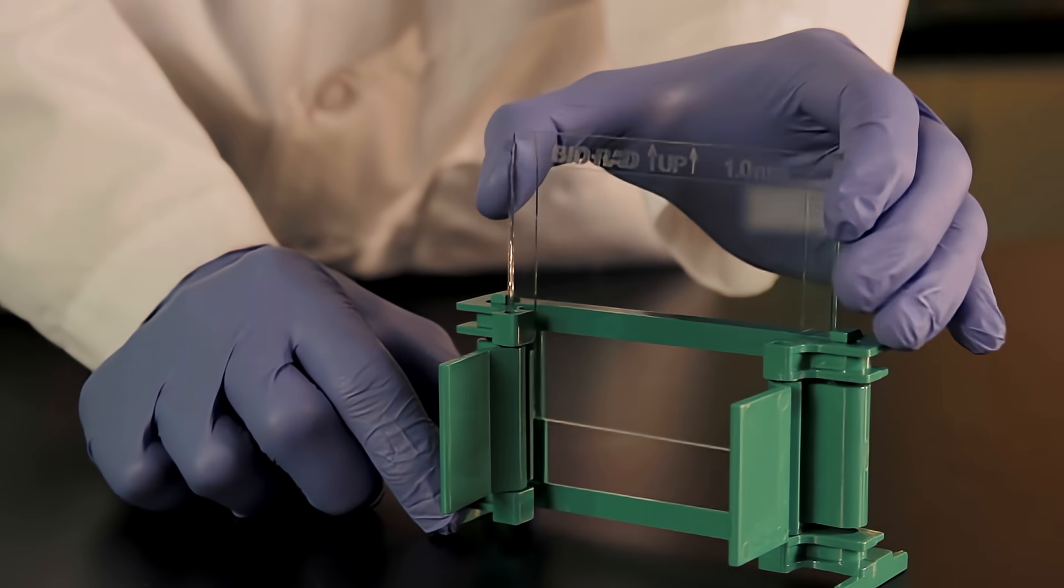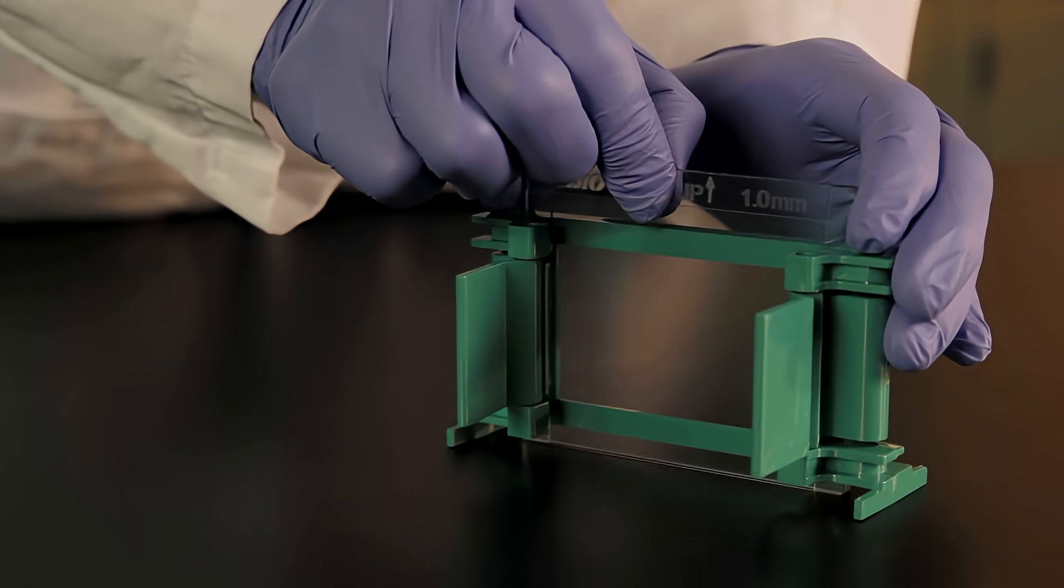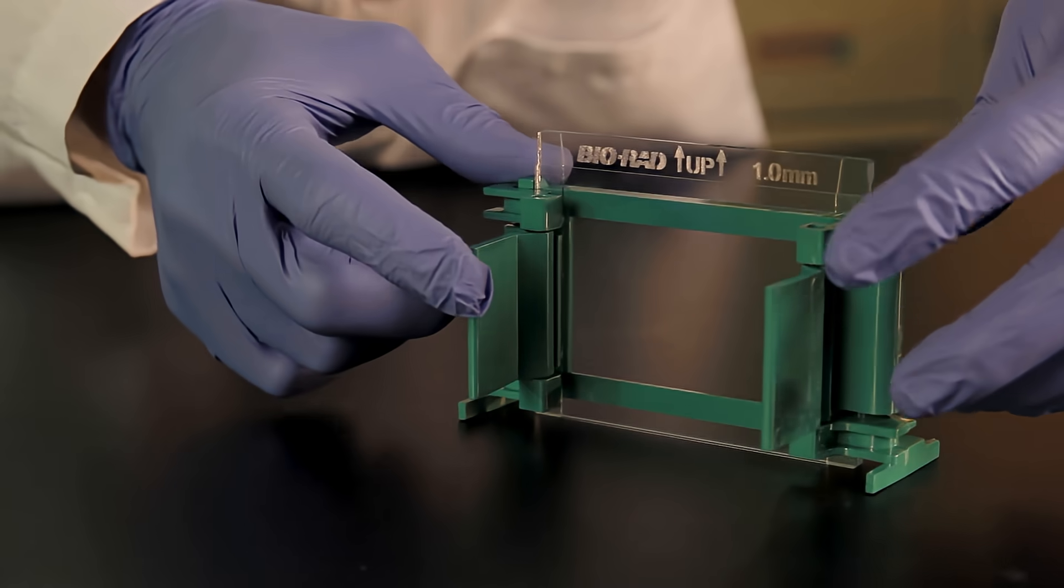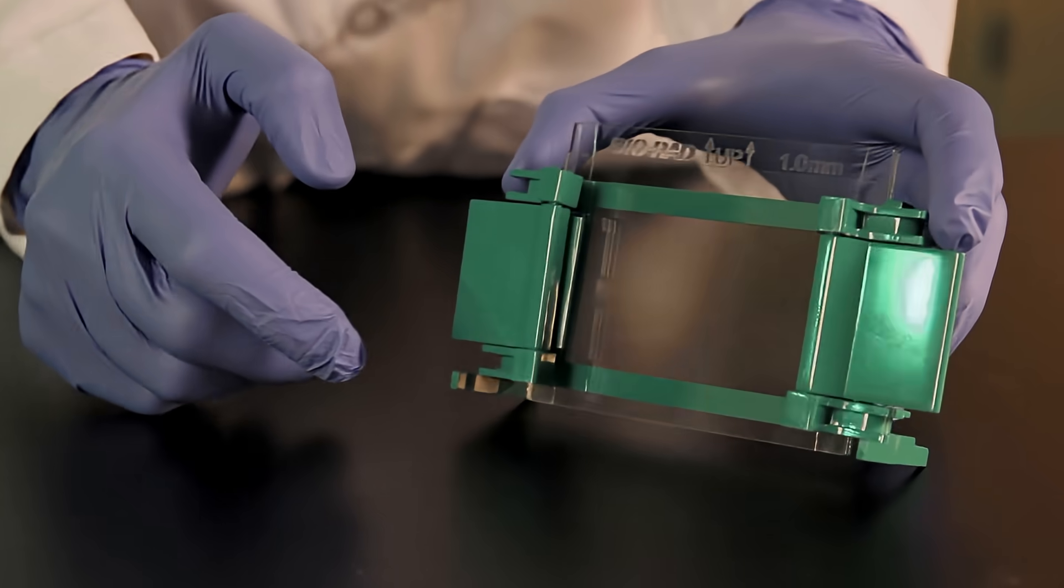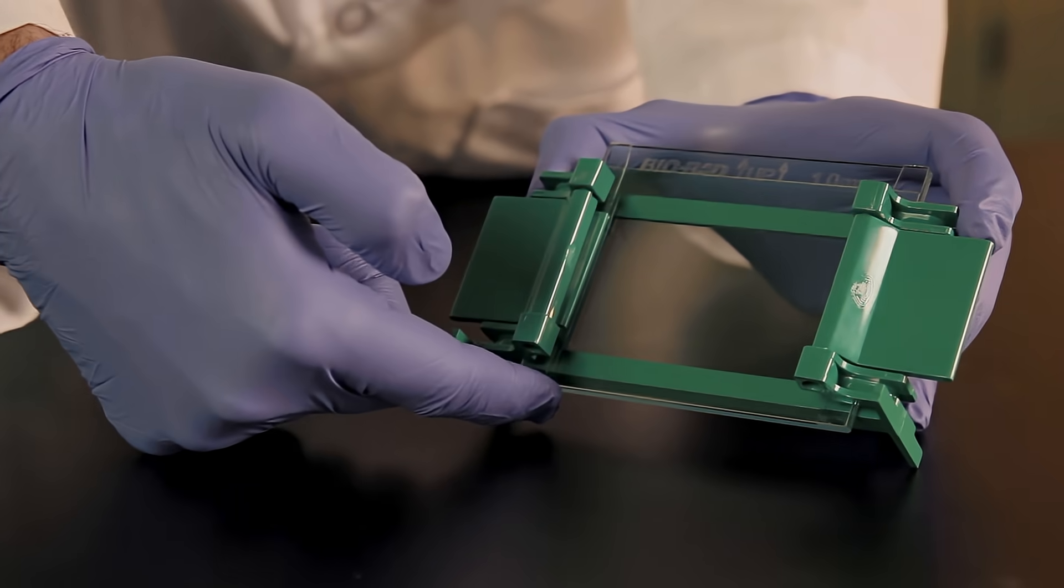Ensure that both plates are flush on a level surface to avoid leaking. Engage the pressure cams to lock the glass plates in place. Check once more that the bottom of both glass plates are flush.